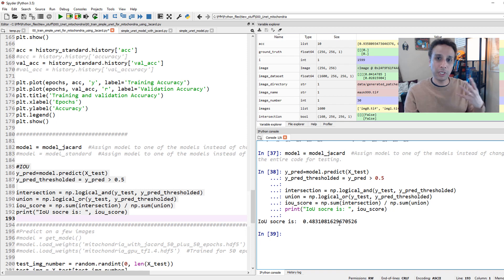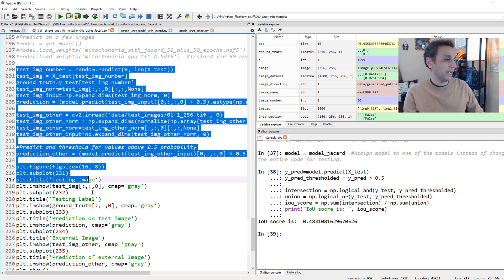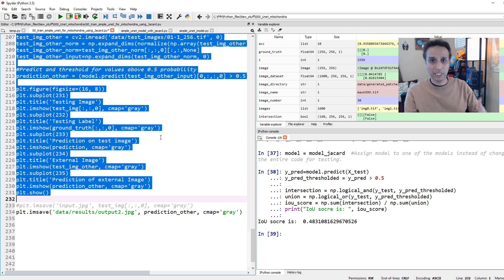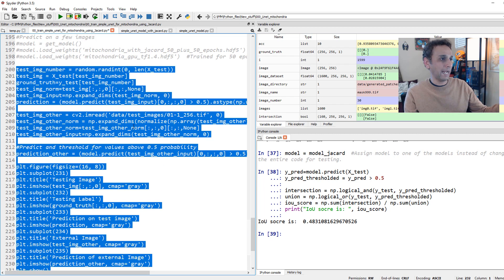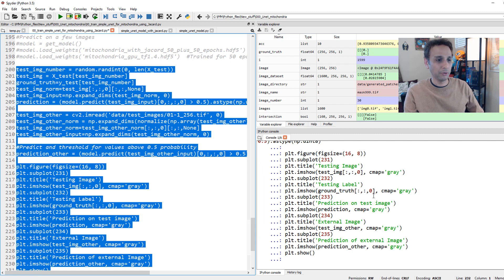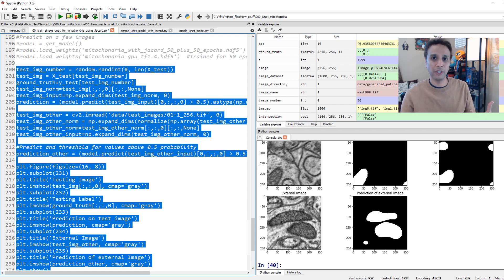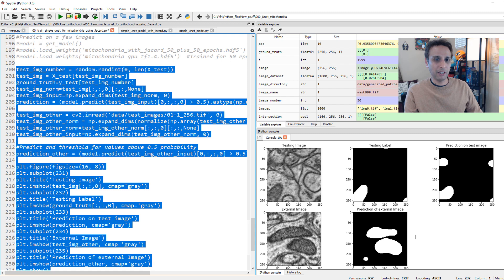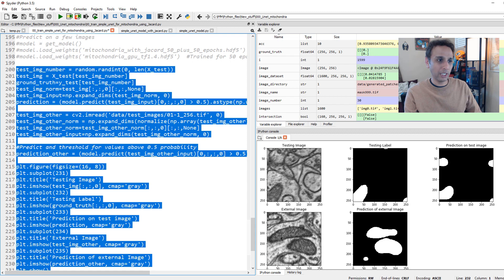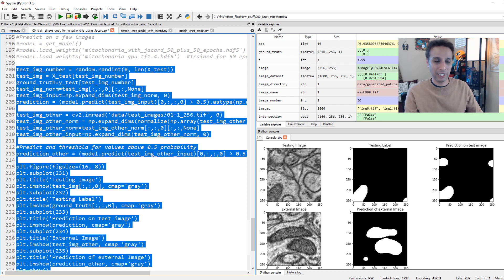Let's go ahead and do our plotting. All I'm trying to do here is randomly load an image from our test dataset, and then load an actual image and segment it, an actual image that's coming from somewhere else, and then just comparing these two. Let's go ahead and do this, and that's not bad. The results are not impressive because we are using only a tiny dataset for training, but they're much better than using our accuracy in binary cross-entropy, as you can see in this case. The testing labels, this is the ground truth, and here is the prediction on test image. You can see why this thinks that this is a mitochondria. I bet after a few epochs of training or adding more data, then this will get better. This is not bad actually, this is also doing pretty good here.